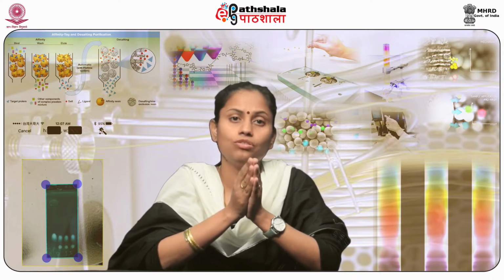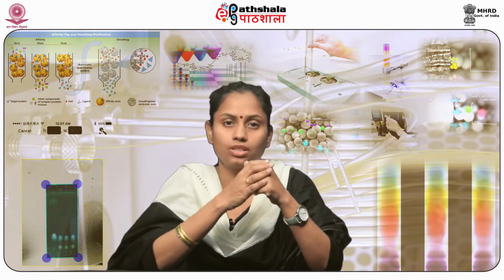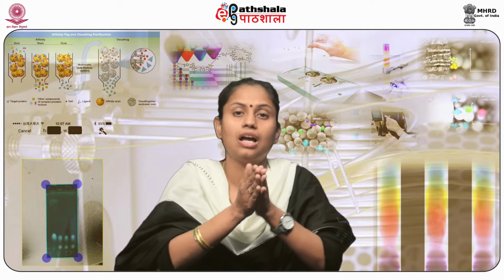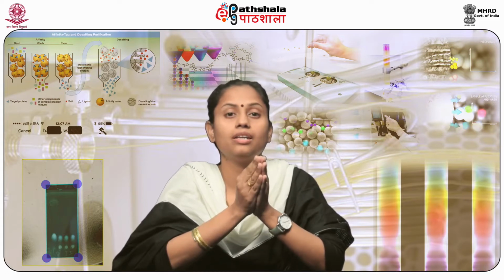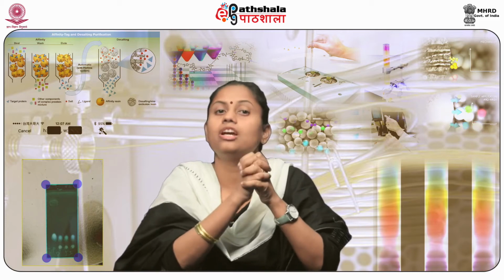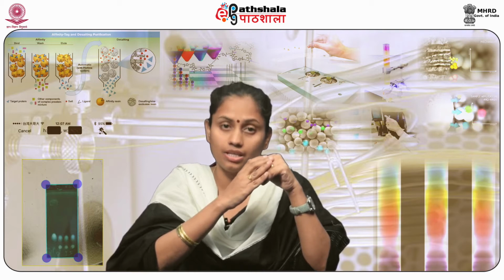The separation of molecules from a mixture depends strongly on the ionic potential, which is linked to the ionic charge, that is Z, and ionic radius, that is R. Molecules with high charge and small radius bind strongly to the matrix. Molecules with low charge and large radius exhibit weak electrostatic binding, hence they are eluted first.